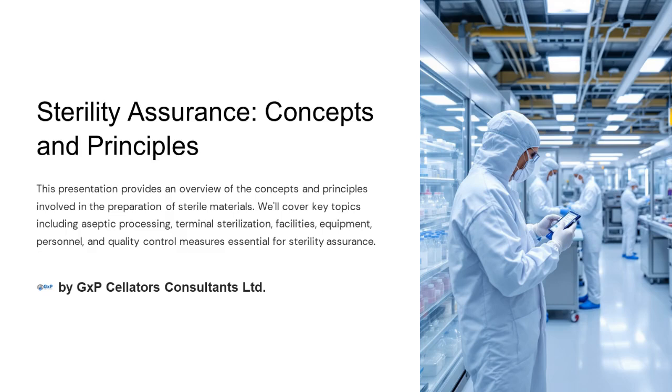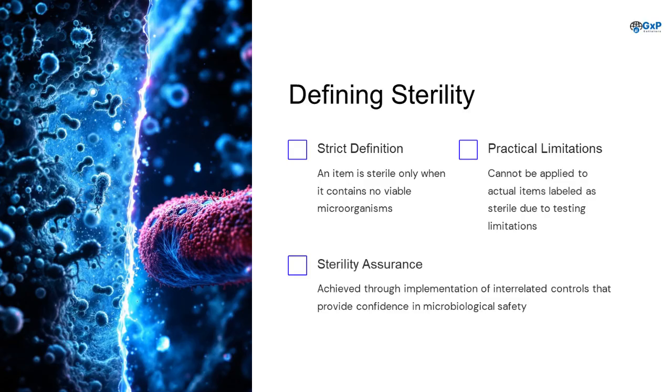Welcome to our presentation on sterility assurance, concepts and principles. Today, we'll explore the essential topics in the preparation of sterile materials, including aseptic processing, terminal sterilization, facilities, equipment, personnel, and quality control measures. Sterility is defined as the absence of viable microorganisms.